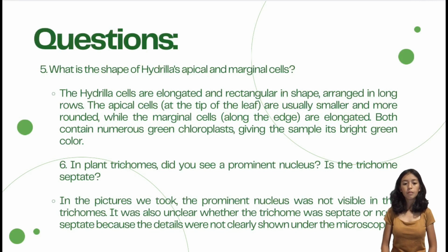Number 6. In plants' trichomes, did you see a prominent nucleus? Is the trichome septate? In the pictures we took, the prominent nucleus was not visible in the trichomes. It was also unclear whether the trichomes were septate or non-septate because the details were not clearly shown under the microscope.